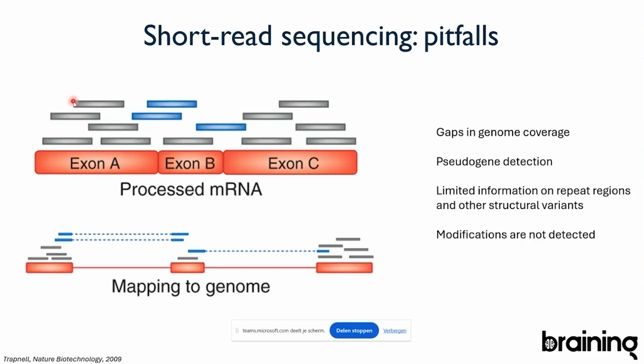And that's what you see here, right? You have all these different sequences, and sometimes they overlap, sometimes they don't. Basically, they're like small pieces of a puzzle that you have to fit into the puzzle itself. If you take all those pieces together, you can make the genome. However, every piece by itself is only 500 base pairs.